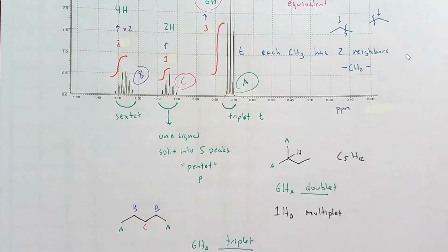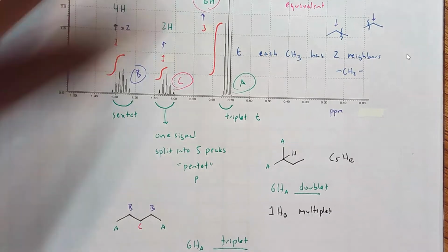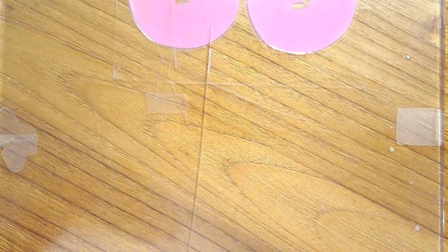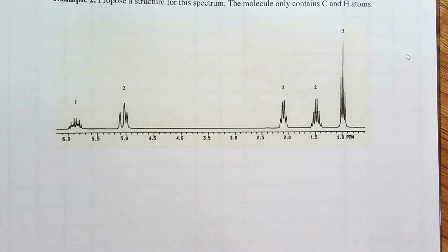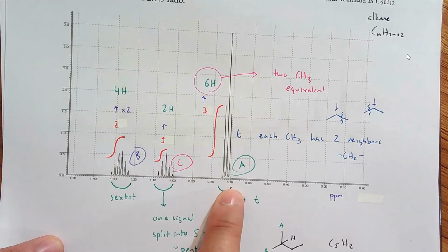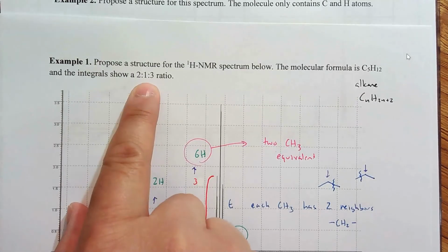Now, I can't believe it's already 23 minutes. This is so much fun. Said unsarcastically. I'm not going to get to chemical shift, because there's so much we can do, right? There's so much we could do just from the number of signals, the integrals, and the splitting. I did not need to know that a methyl group occurs around this ppm, or that CH2 groups occur around these ppms. I was able to figure out the spectrum just based on splitting and the integral. Right? They taught us the integral here.